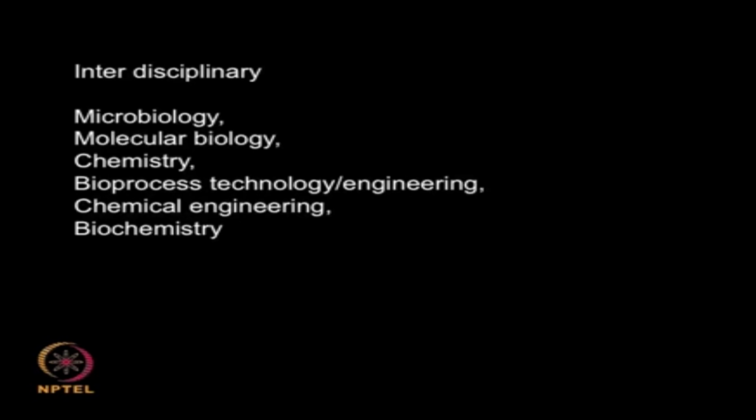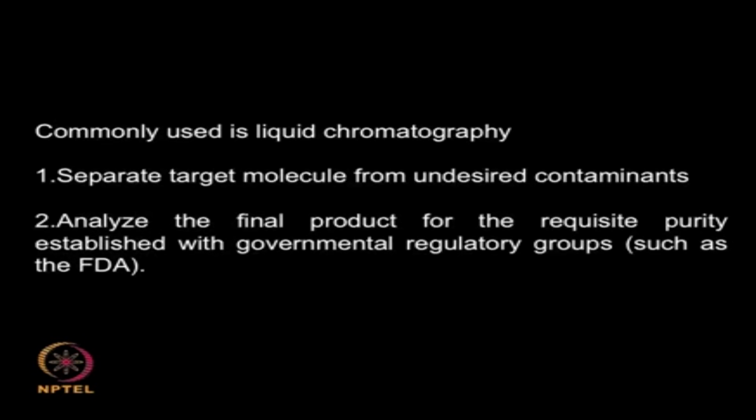So you see, chromatography is a highly interdisciplinary subject. We need to have expertise of so many different disciplines. Microbiology comes in, molecular biology, chemistry, bioprocess technology and engineering, chemical engineering principles, biochemistry principles, and so on. So we need to consider all these aspects when you are designing a chromatography system for a purification or a separation of a protein.